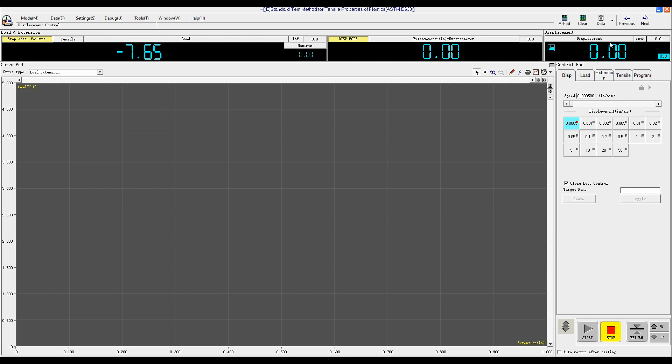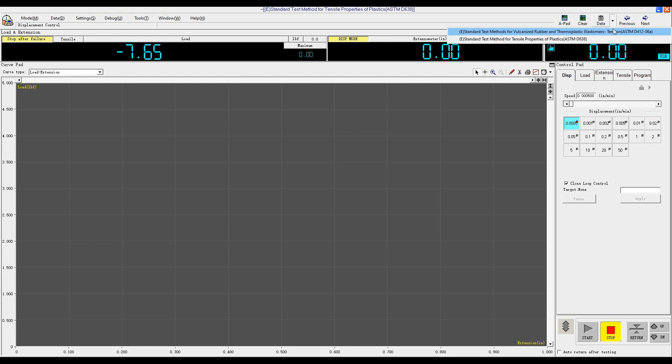And then click Date. To choose the test standard, we will perform a tensile test of plastic. We select ASTM D638.